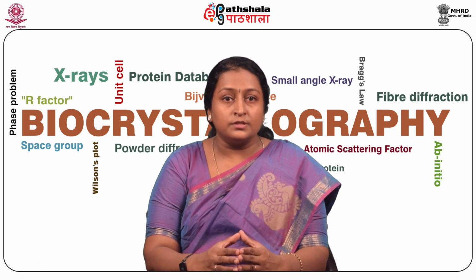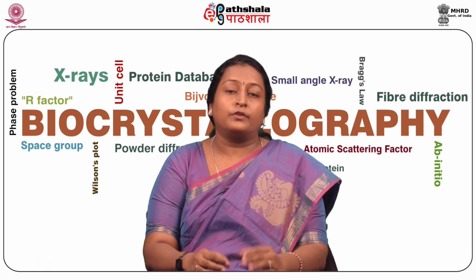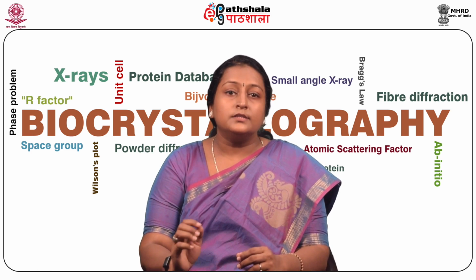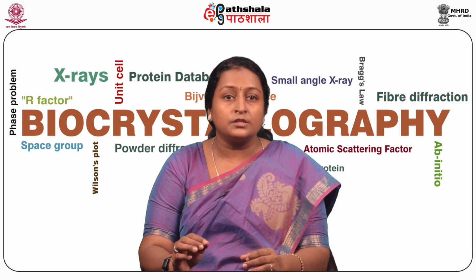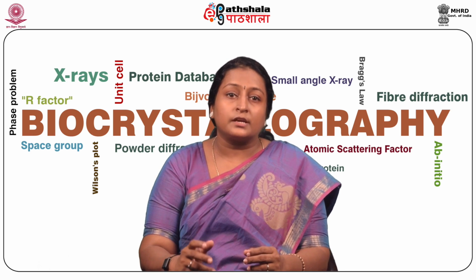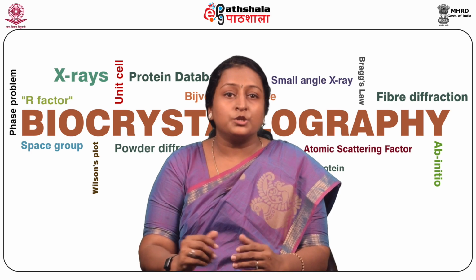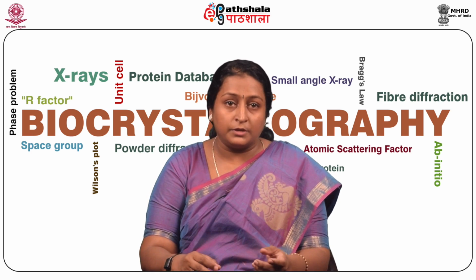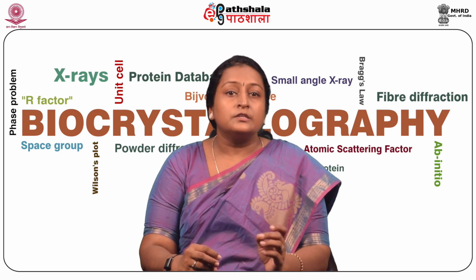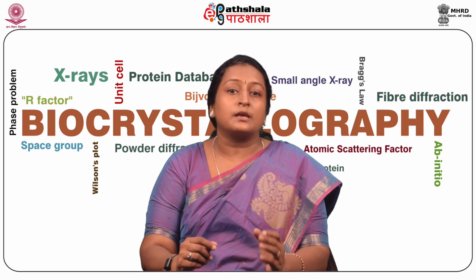Moving on to the applications, X-ray powder diffraction is most widely used for the identification of unknown crystalline materials, for example minerals and inorganic compounds. The determination of unknown solids is very critical to studies in biology, environmental sciences, geology, material science, engineering, and many other fields. Other applications include the characterization of crystalline materials. It is used in the identification of fine-grained minerals, in the determination of unit cell dimensions, and also to check the sample purity.